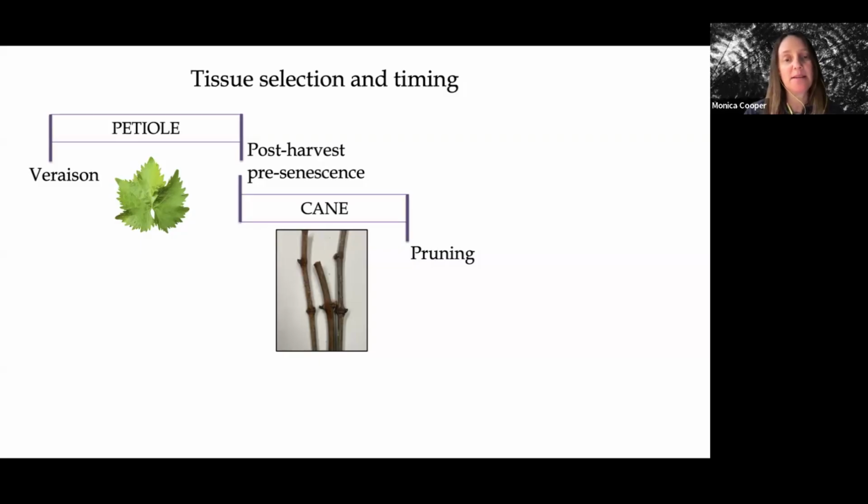If you're enterprising about it, you could actually do all your sample collection of your canes and store them frozen. So before you go through that step of collecting the tissue from the canes, you can store them frozen. And so that can extend the period in which you can use the canes for sampling because you can store them in the freezer.